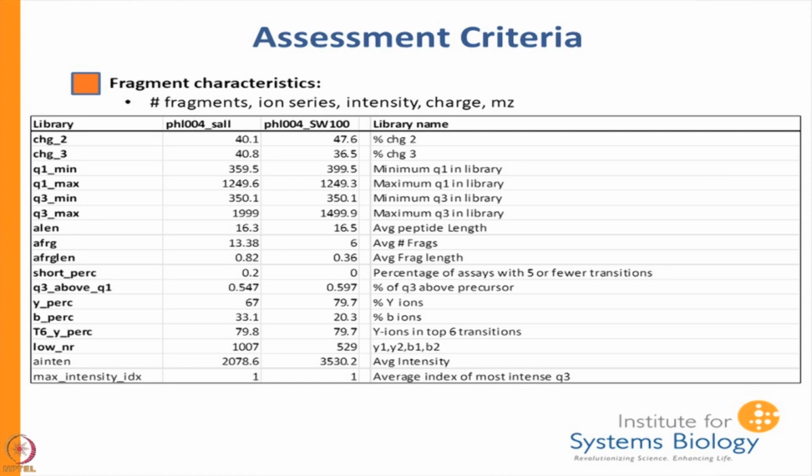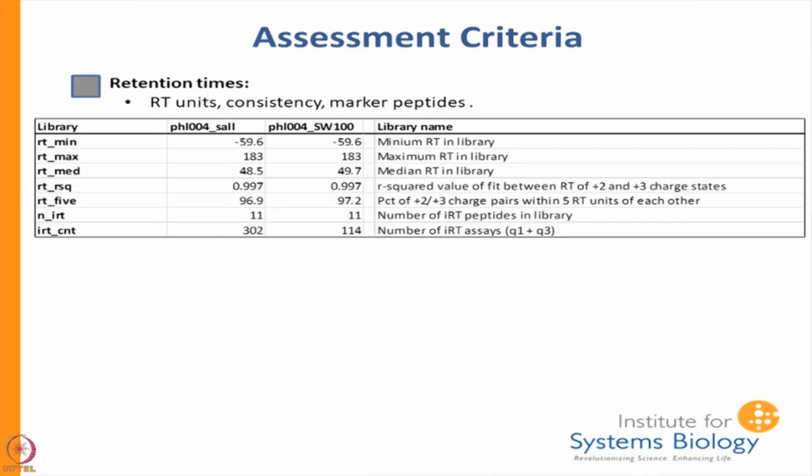We just look up to 1,500 because, again, we want to set our cycle time so that we can sample across the peak. So yeah, there are all these different things. I'm showing it to you, and you guys in the back can't even see what it is, but if you're trying to assess the validity of your library, it's actually very helpful. And we have had a number of occurrences where this has helped us a lot.